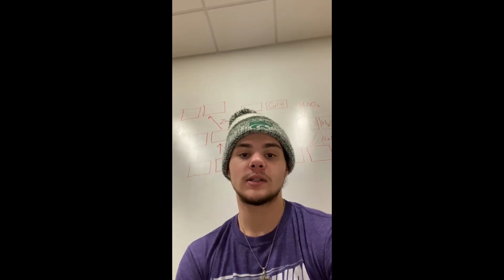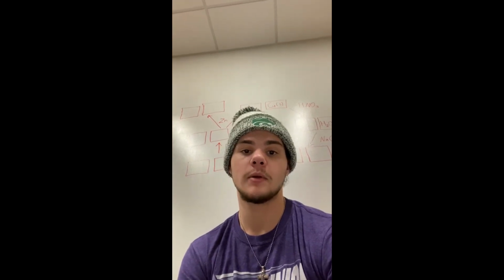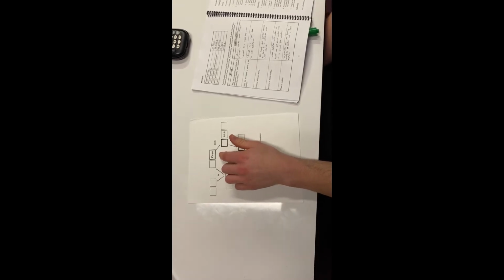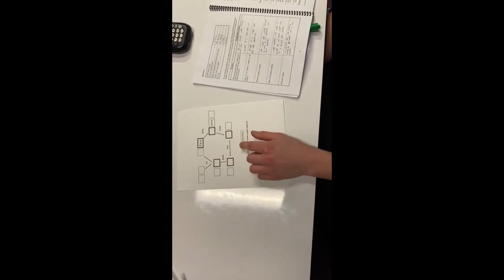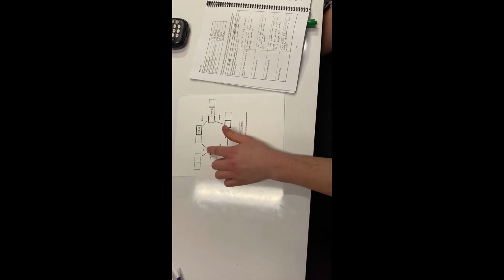I'm in Chemistry 110N, Lab Section 2, and I will be performing the experiment reactions of copper and percent yield. The experiment started with pure copper. Throughout the experiment, nitric acid and sodium hydroxide were added to the copper and then heated. After it was heated, sulfuric acid and granular zinc metal were also added.